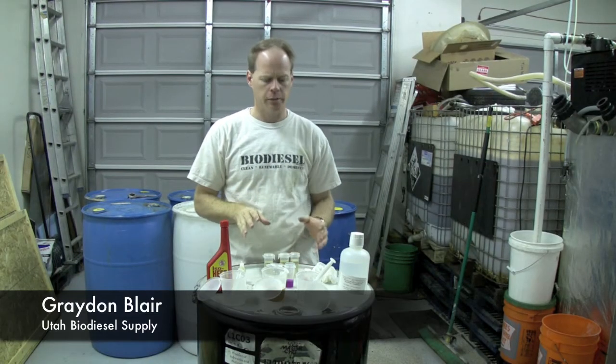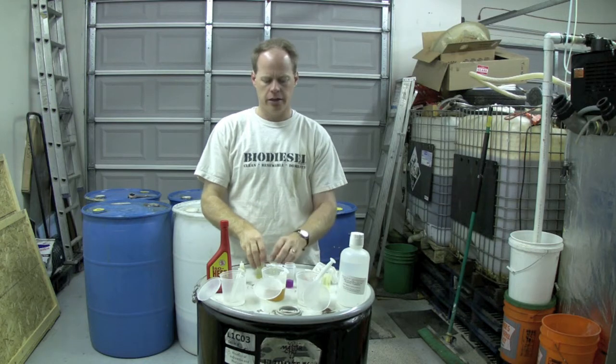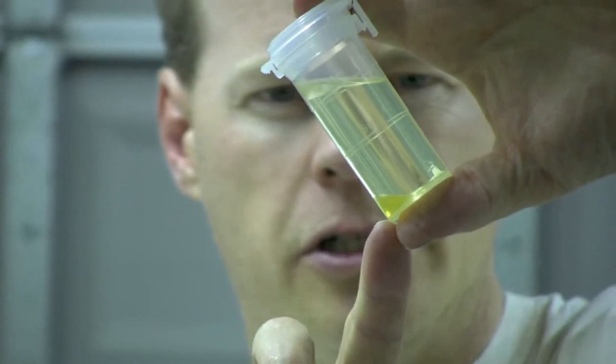The reason we do titrations is we want to make sure we had enough catalyst to make a successful batch. I have in front of me here some batches that we did — one was less than successful. This is a 327 test, and if you look real close you can see that this did not react well.